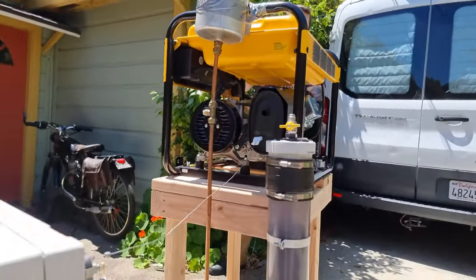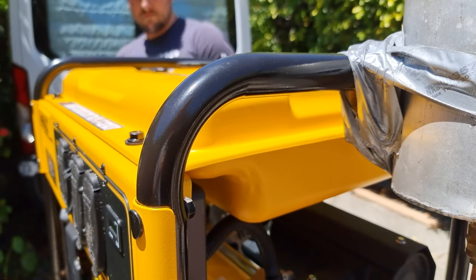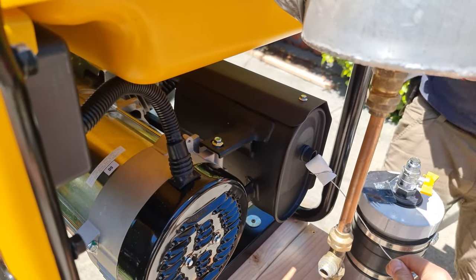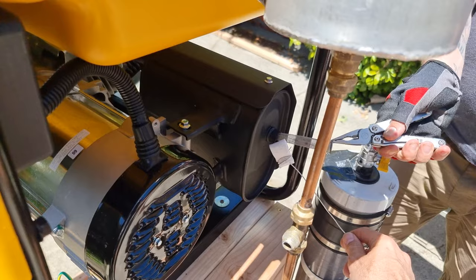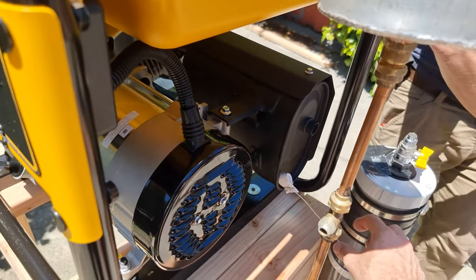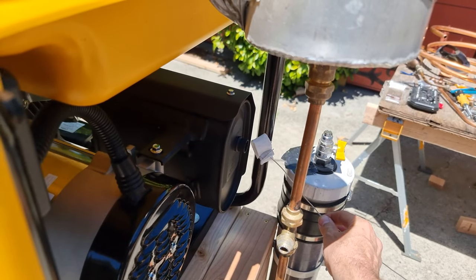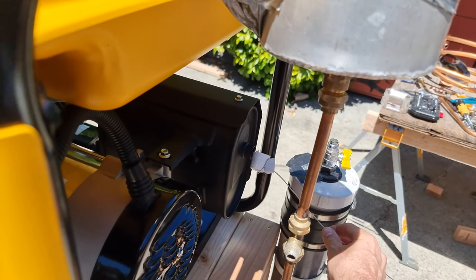That blew out. We might have to tie this one with wire. So I turn it off now and tie this on with wire.